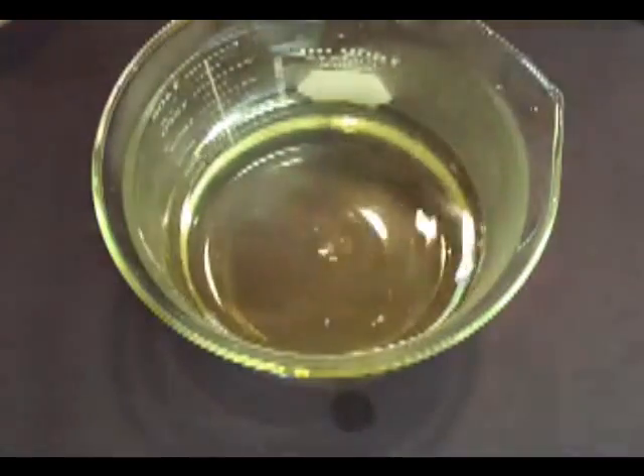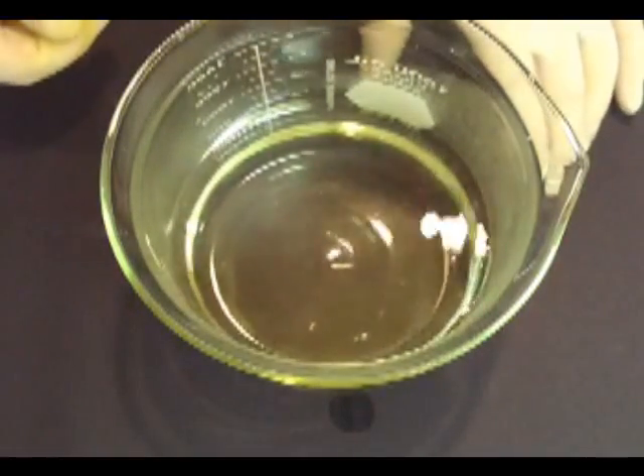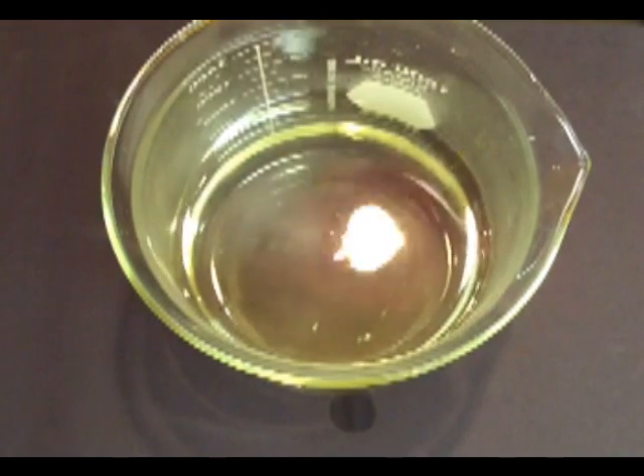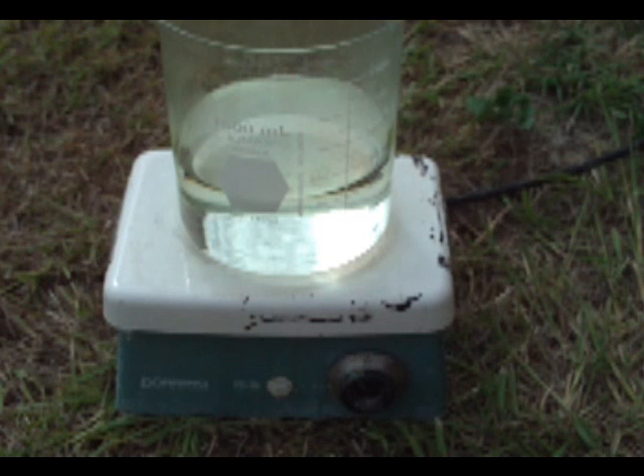Here's our mixture. It has a slight yellow tint due to contaminants in the hydrochloric acid — not to worry, it will not be there in the final product. So now let's take this outside and place it on a hot plate turned to high heat. Be sure to add some boiling stones. We want to boil off about two thirds of the volume to get rid of the water.